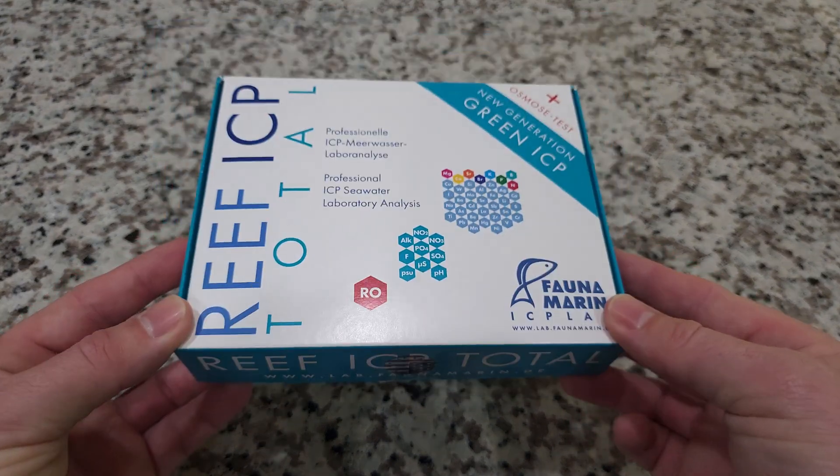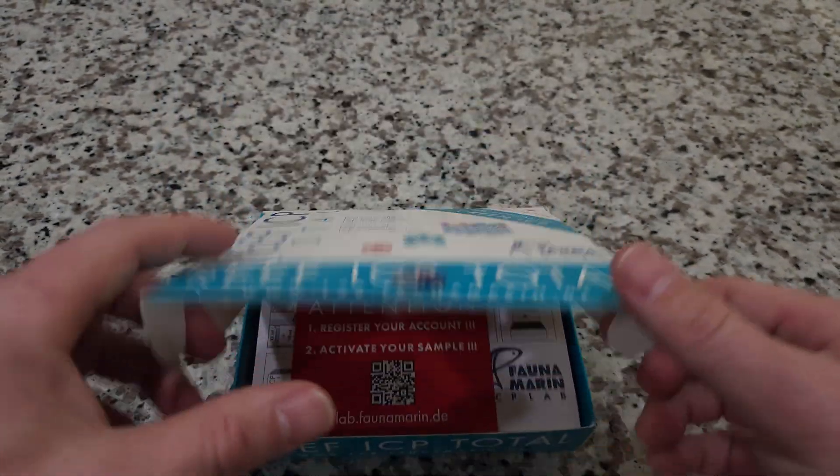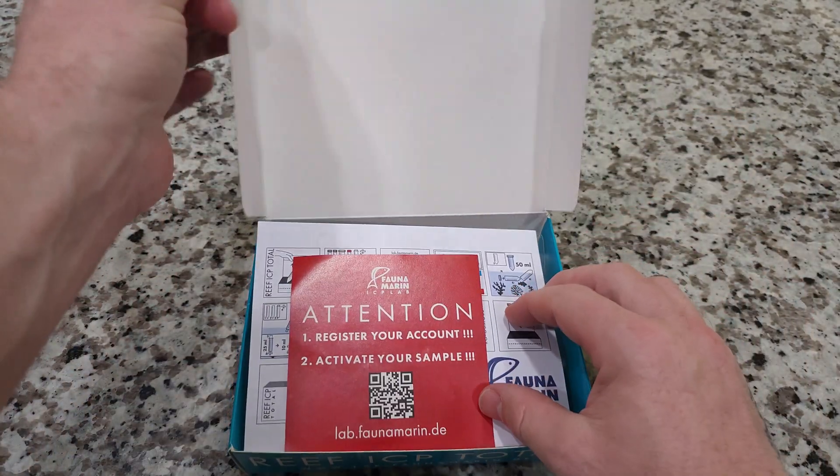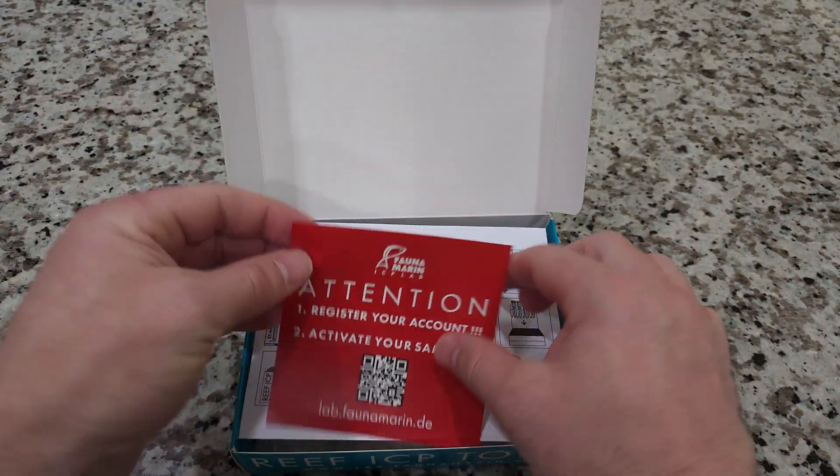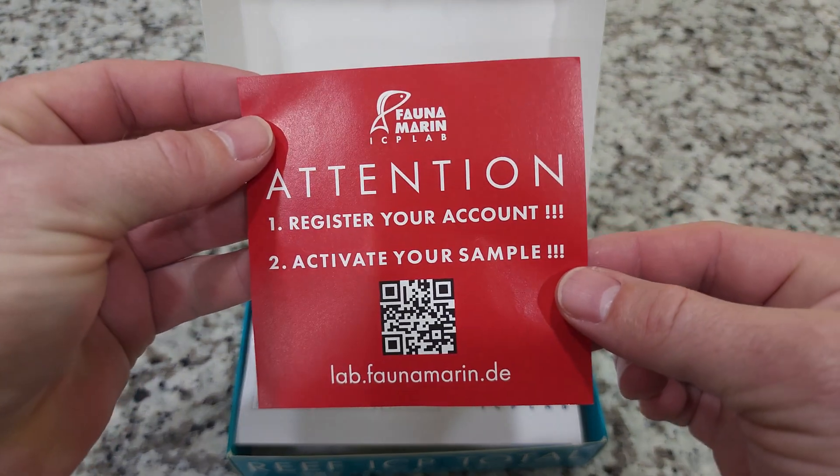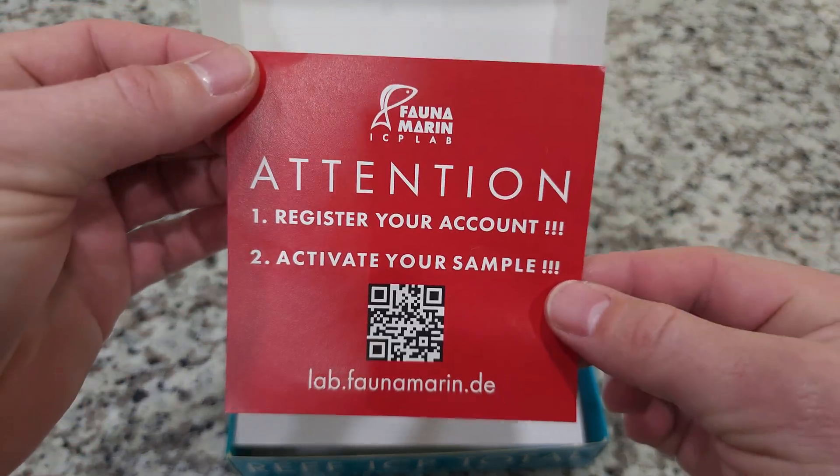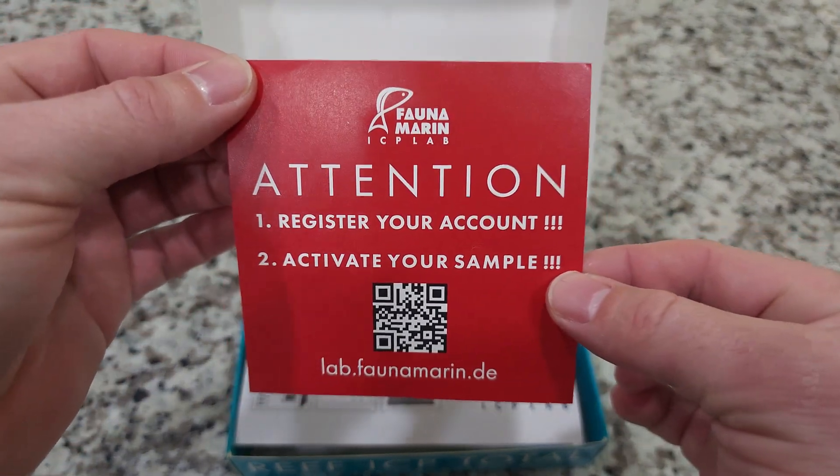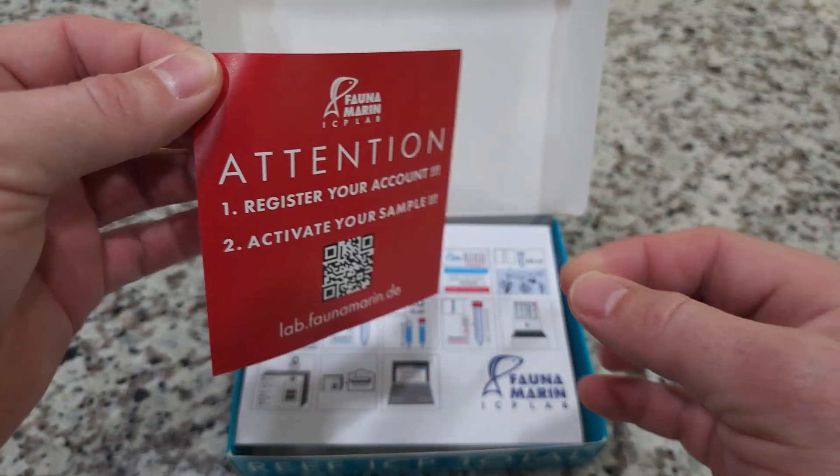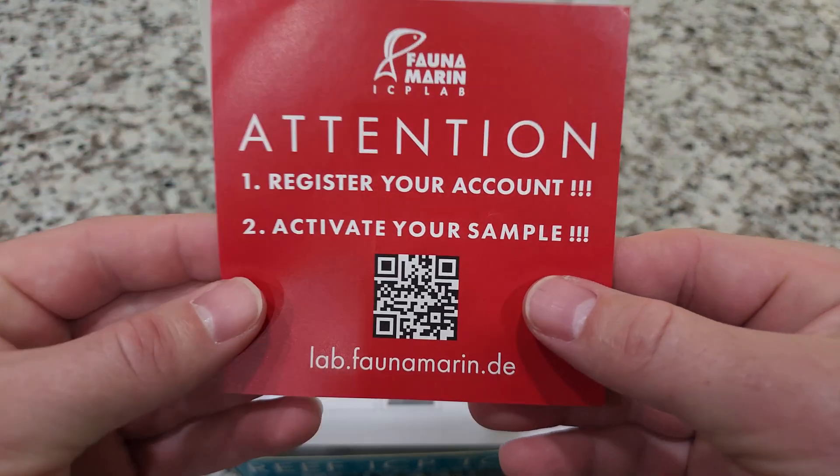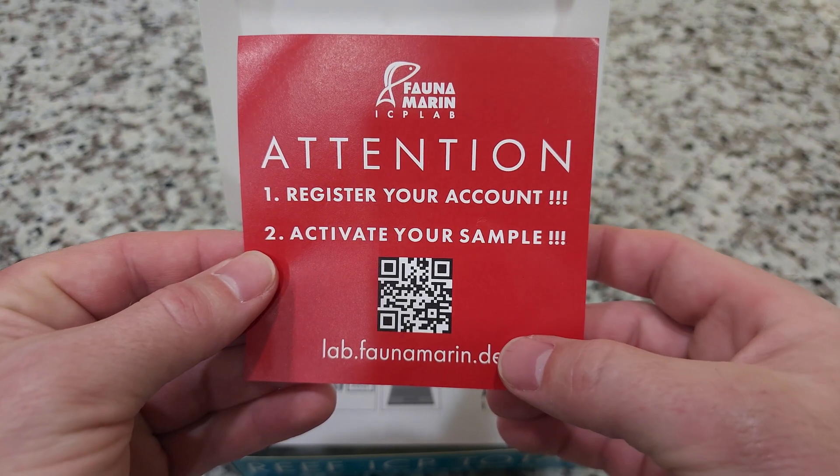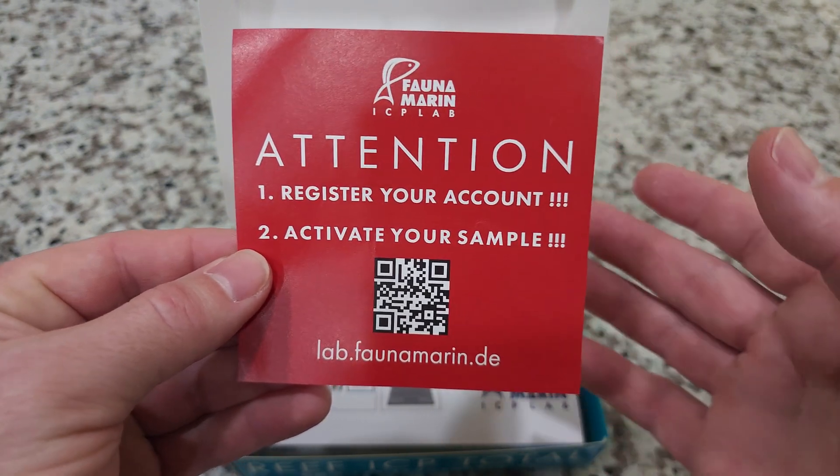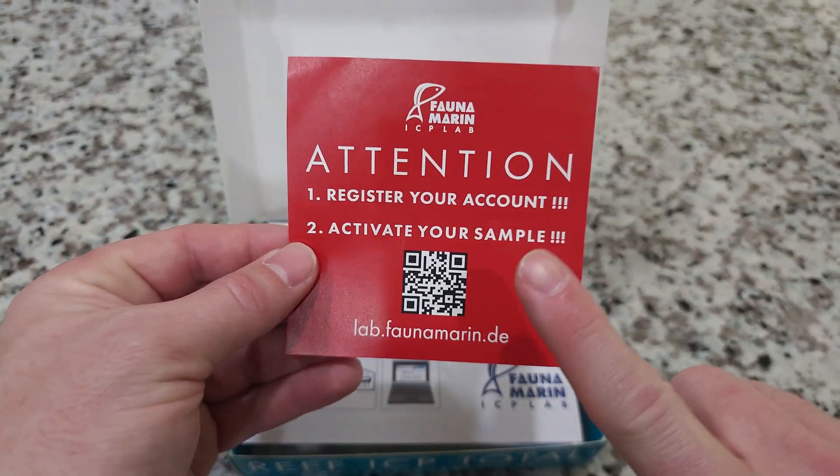When you get your box, this is what it's going to look like. Busting this thing open, the very first thing you're going to see on top is this little warning. Register your account right now before you do anything else with this kit. You can go to the website here or the QR code.